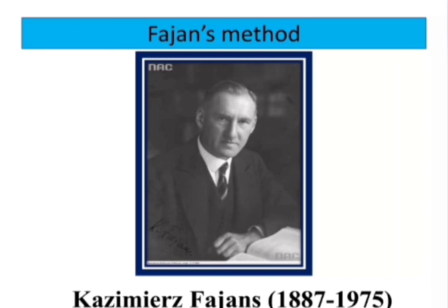Next, Fajans' method. Fajans' method is named after Kasimir Fajans. It uses dichlorofluorescein as an indicator, and the end point is observed when the green color of the suspension turns pink.